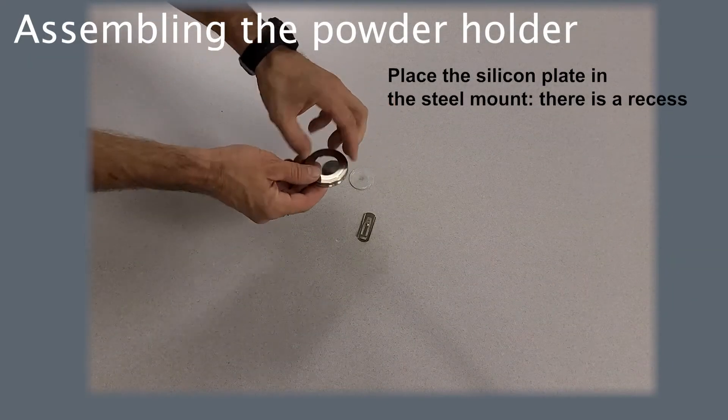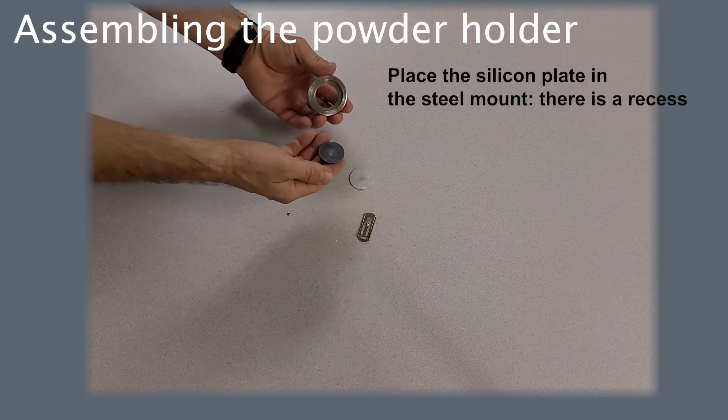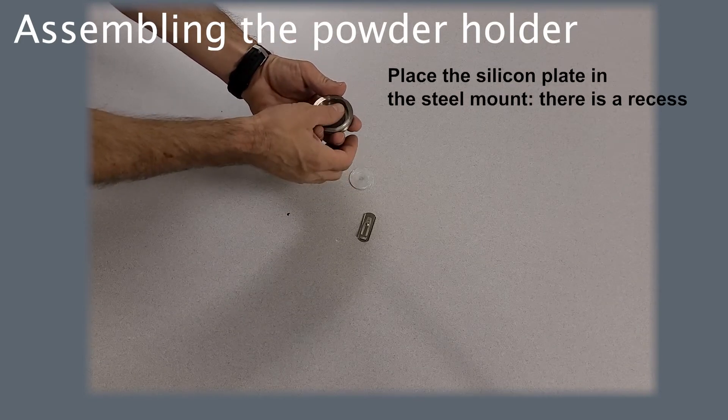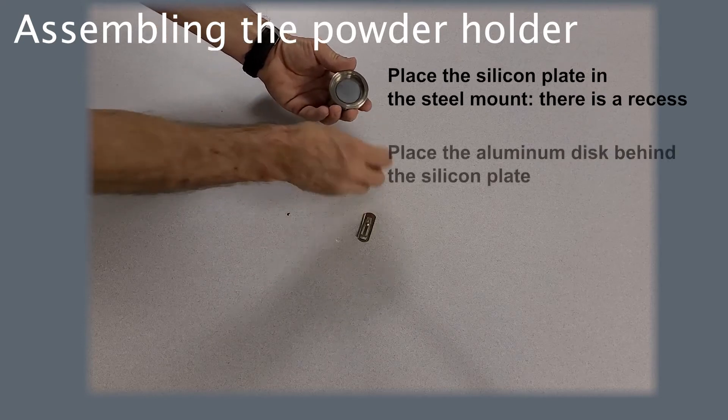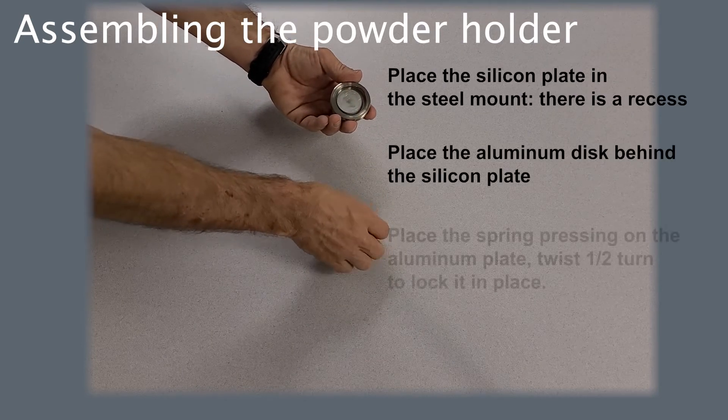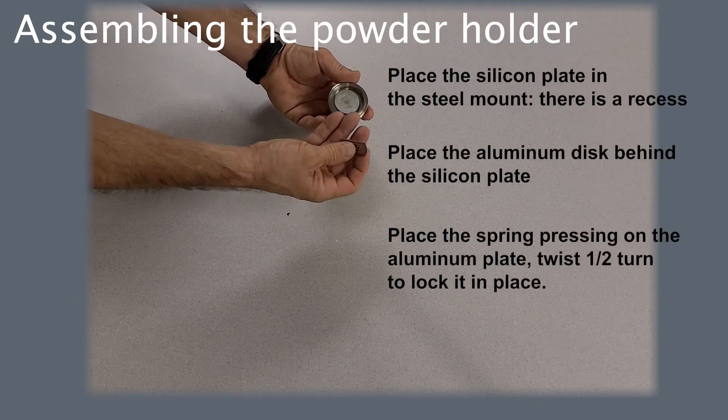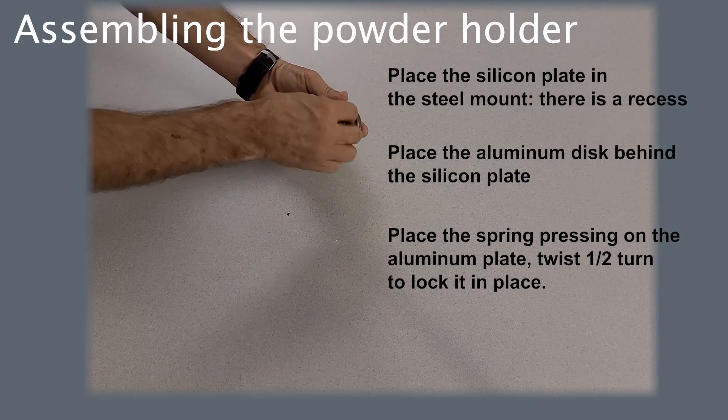To assemble the sample holder, place the silicon plate in the steel mount, fitting it in a recess, place the aluminum disc behind it, insert the spring pressing on the aluminum plate, and twist half a turn to lock it in place.